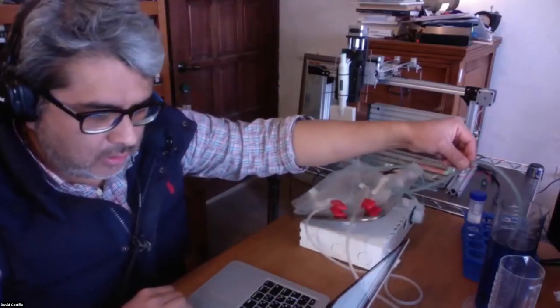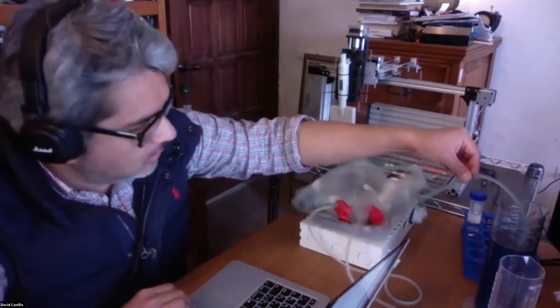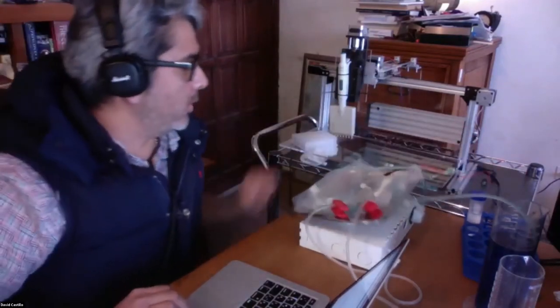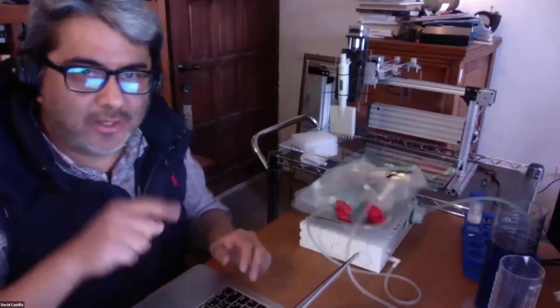And also here, let me turn off, let me see, this is one. This is the air pump that, unfortunately, you're not going to be able to see it, but it's the one that is injecting the air into the media.